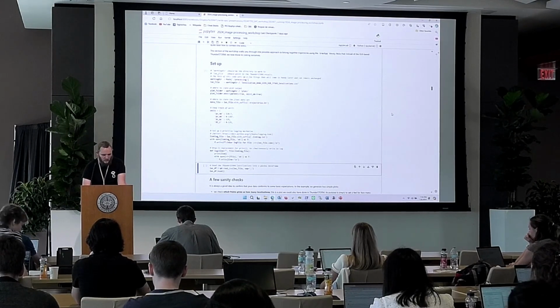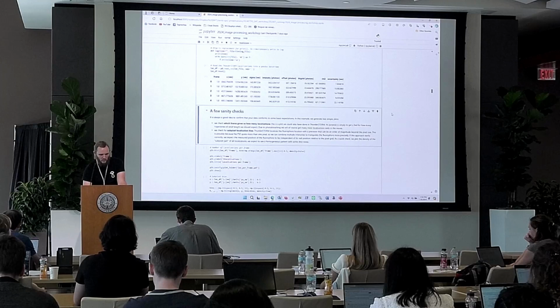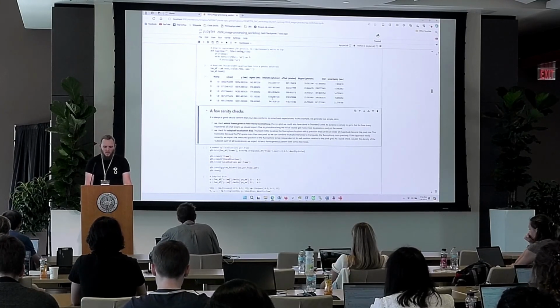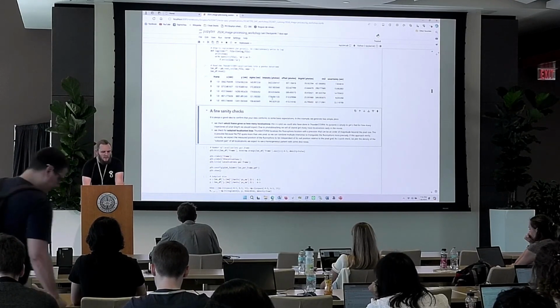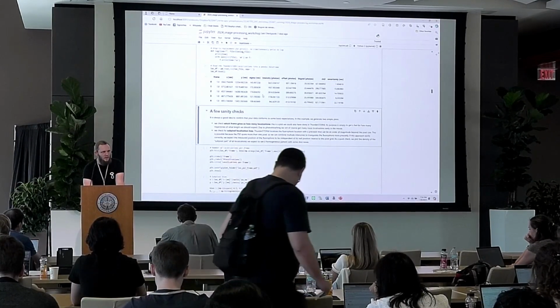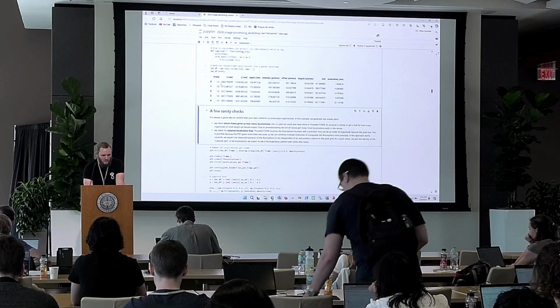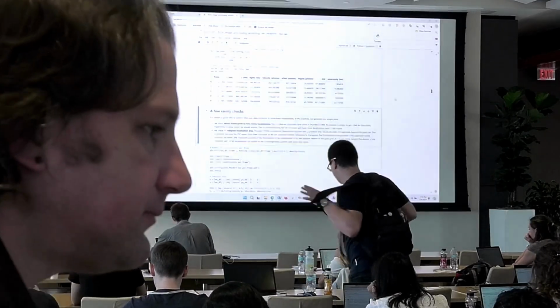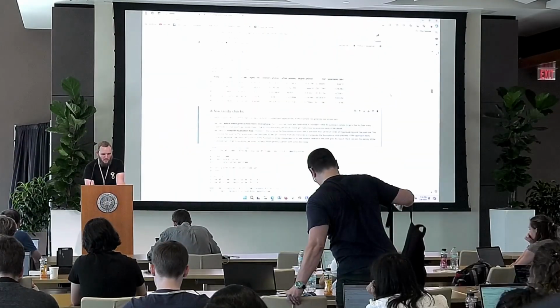The cell below it will actually load the data and show the head of the data frame. So now we loaded the data, and we can see that this is exactly what we saw in the table in Thunderstorm as well. The columns are the exact same thing. We just now have it loaded as a pandas data frame in our Jupyter notebook.